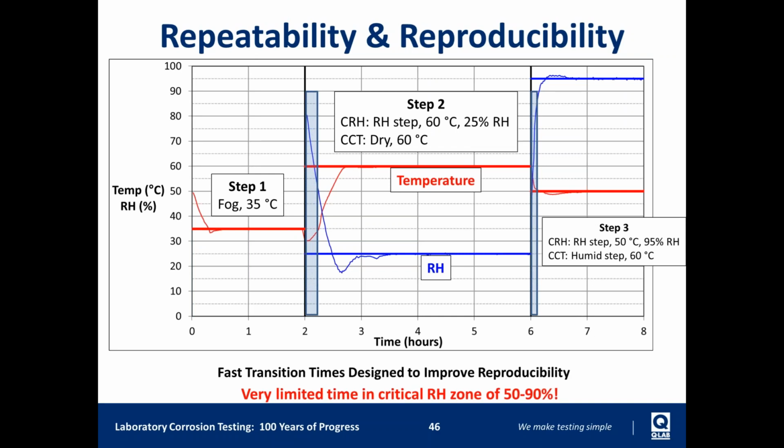And that way they don't have to worry about two different testers or two different tests run at different times performing differently. And as you can see, the areas that we have highlighted are that key range that we were talking about, where you're going to see that corrosion that covers both the steel and the aluminum. It bypasses that galvanic couple.